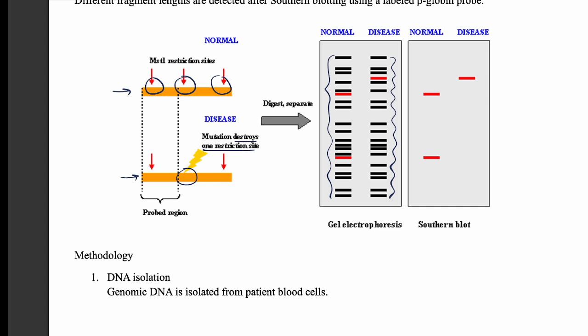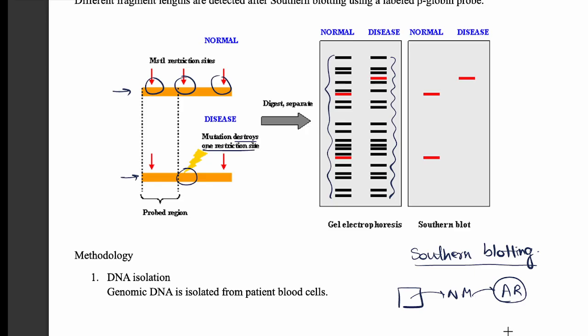One core idea you need to know is that there is this Southern blotting technique which we commonly use in the RFLP analysis. It is nothing but transferring the DNA fragments from the agarose gel to the nitrocellulose membrane, and then from there we have to do the autoradiography to actually detect.